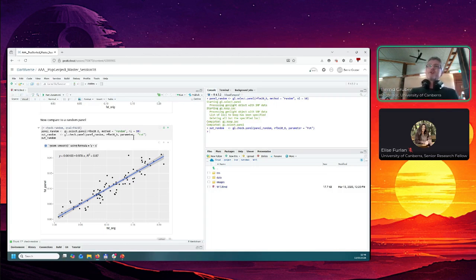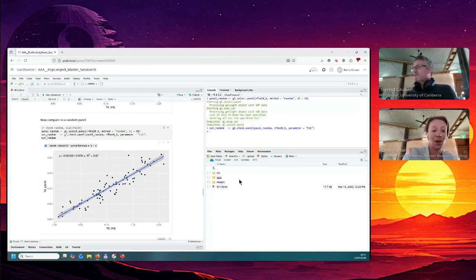The next one I want to know, okay, maybe I want to measure also heterozygosity. So you try to design a panel of heterozygosity, you get a genind object, hopefully you have another 20 SNPs left, and then you try to combine the panels and see how good they are, because why wouldn't you use FST also if it was optimized for another thing? And you can combine it, run it again with a check panel and see how good that is.